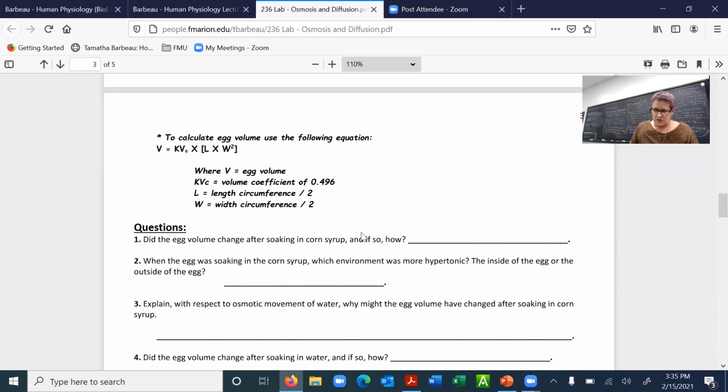If I take the original width of 15 and divide 15 by 2, that should be 7.5, and it is. So now my length is 8.25 and my width is 7.5.